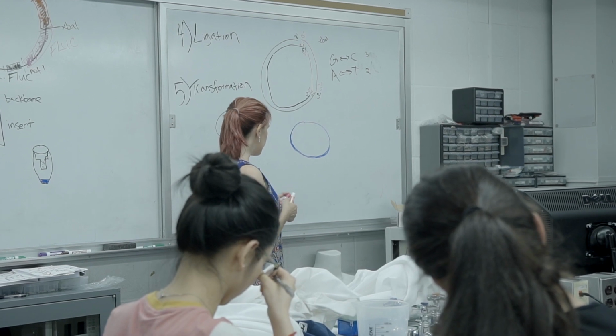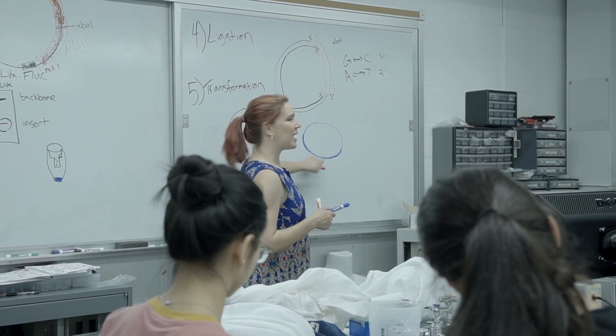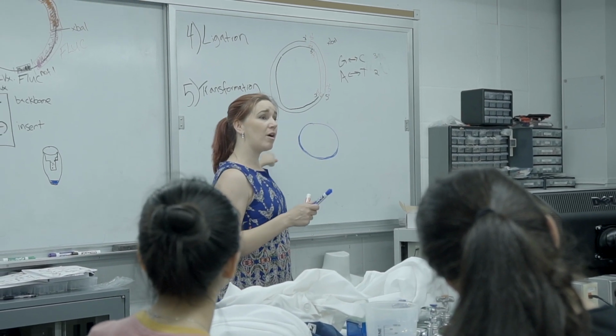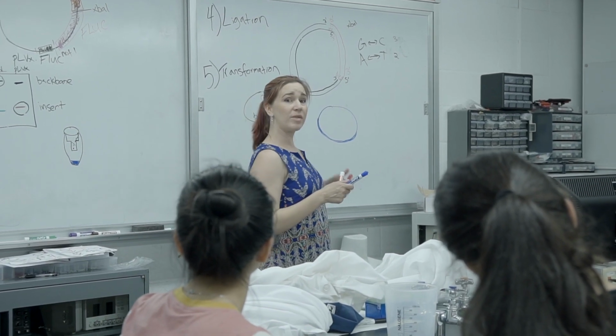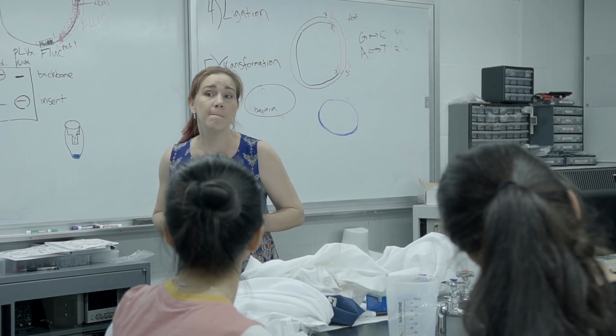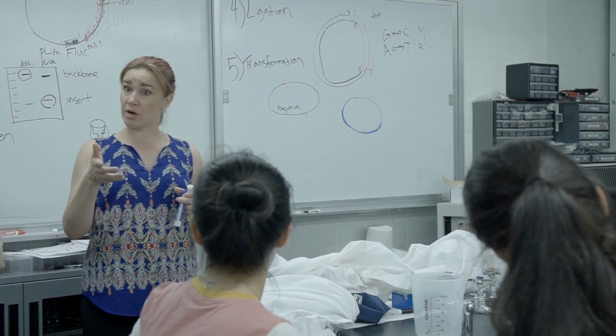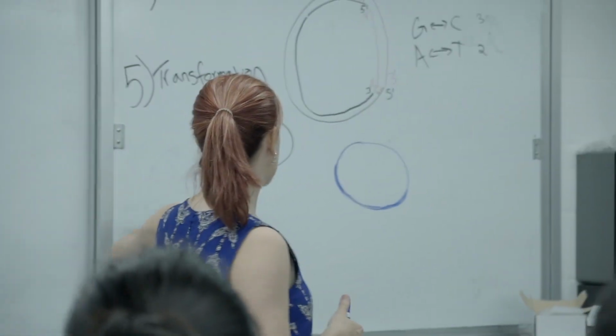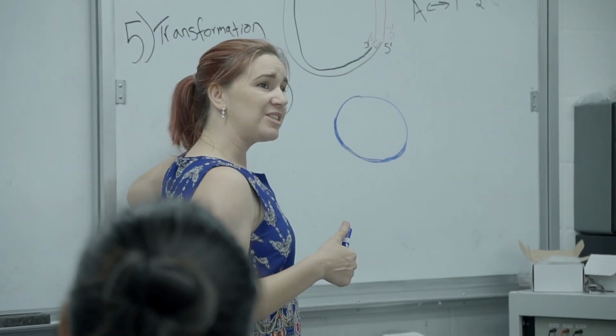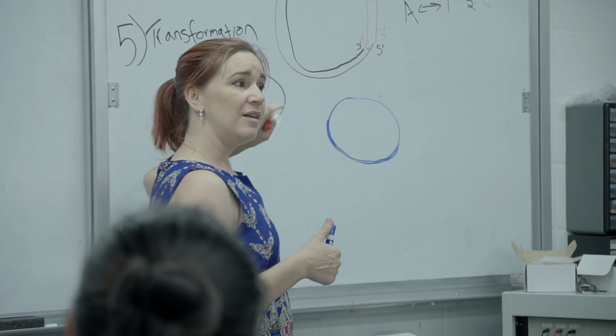And there's a really important thing that my plate needs to have, so I make sure tomorrow morning that the bacteria I see have my plasmid. Does anyone know what that is? Nutrient? The agar nutrient? They'll have agar, which will make them grow, exactly. But there's something else, because I don't want all my bacteria to grow. I only want the bacteria that has my DNA in it.